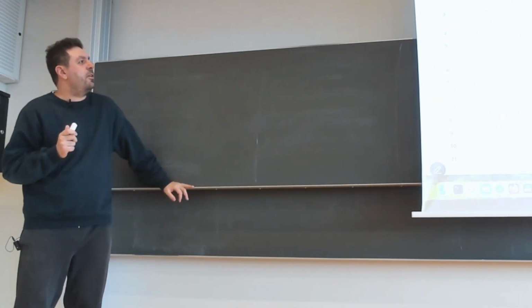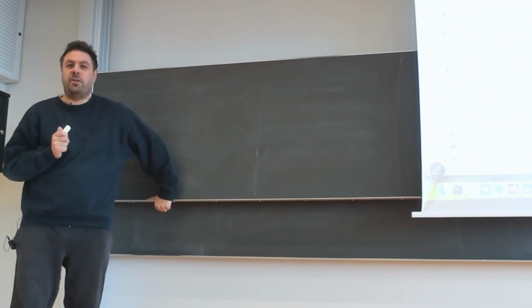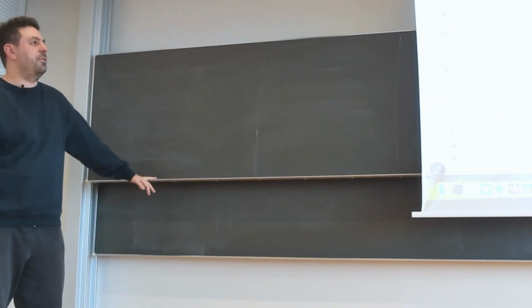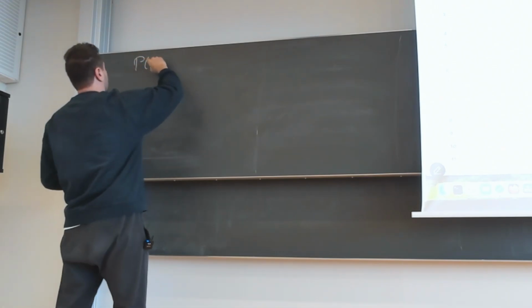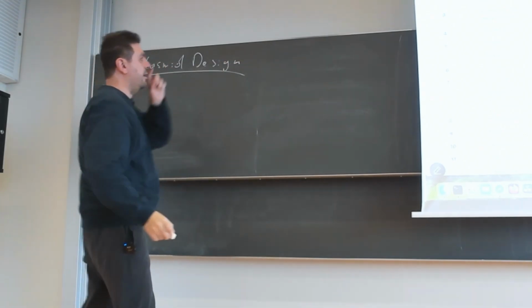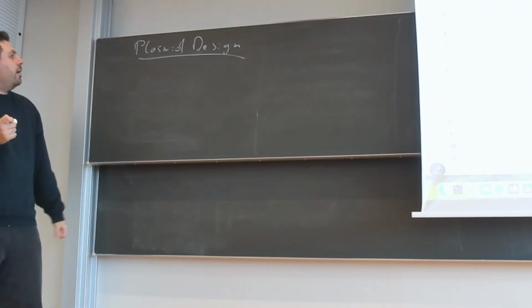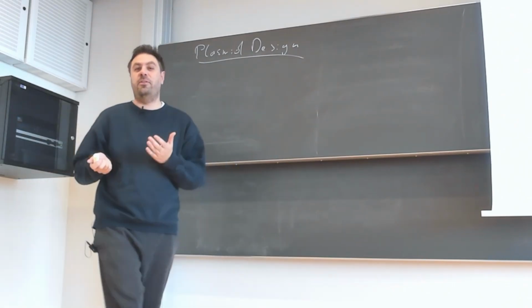And today we are creating our first little program completely ourselves. So I think this will be a nice milestone. So what is this actually about? Let's get started on why we do that. So the purpose of this session is to write, together with you, a Hello World program in DNA.